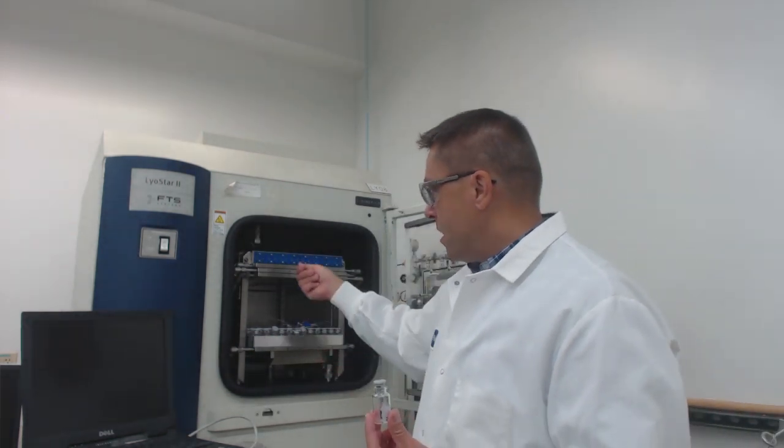One reason why we like these wireless sensors is that they can be steam sterilized, so they could be used in our production process. We also don't have all these wires. One challenge of placing thermocouples in vials in a manufacturing area is that we can negatively affect sterility assurance. In a production area, we may only be able to test or monitor the vials that are closest to the front of the door. These wireless thermocouples allow us to place vials with temperature sensors along the line, and they can be randomly placed on an entire shelf.